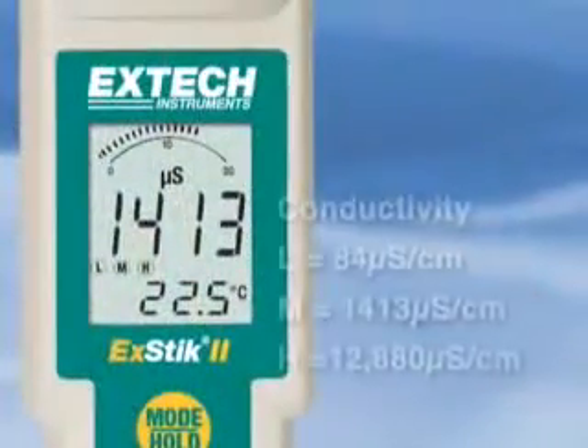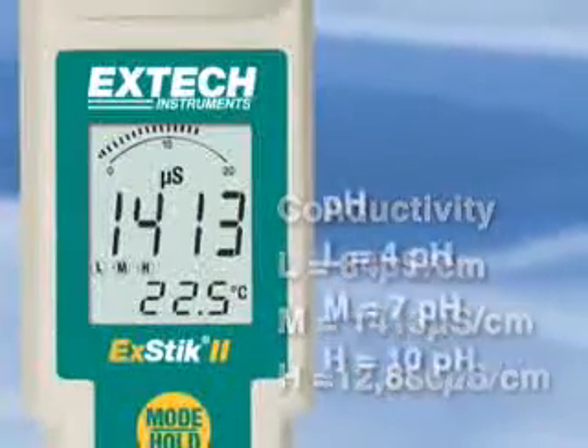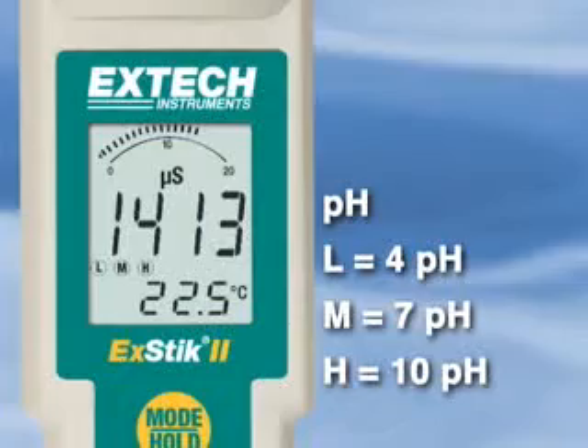The memory also stores your last pH or conductivity calibration, displaying L, M, or H — low, medium, or high — on the instrument screen.